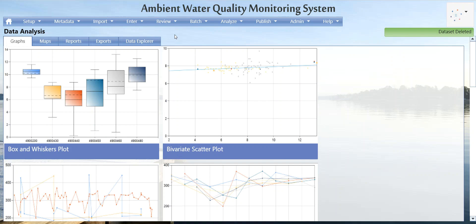Hi, my name is Molly and I work at Gold Systems on the Aquam support team. In this video I'm going to be showing you how to import your field and lab data.